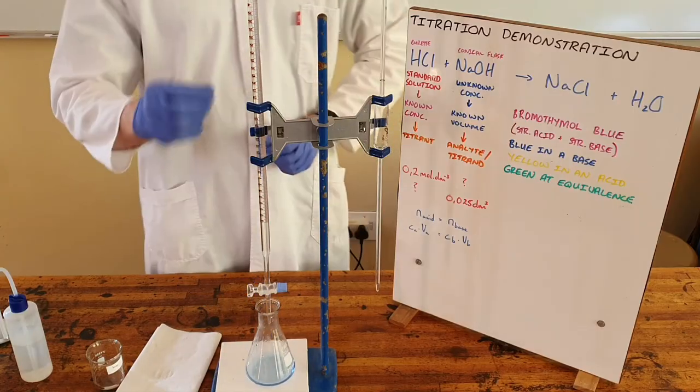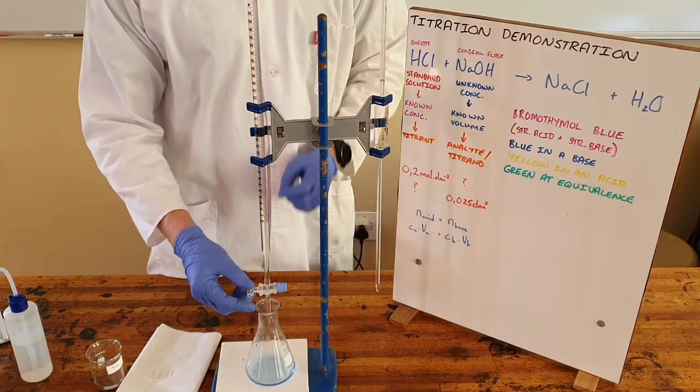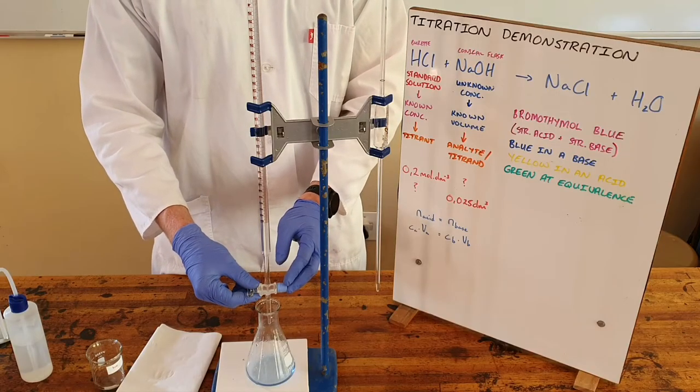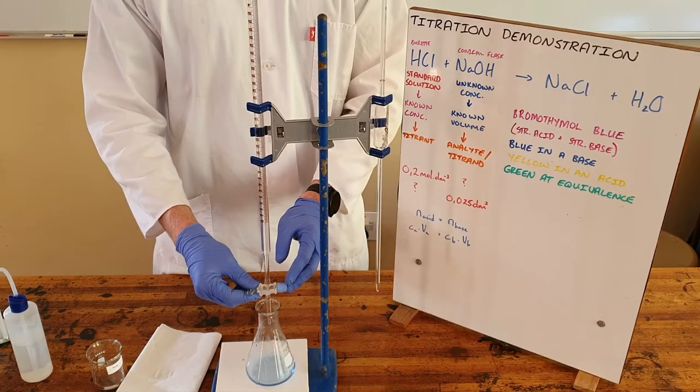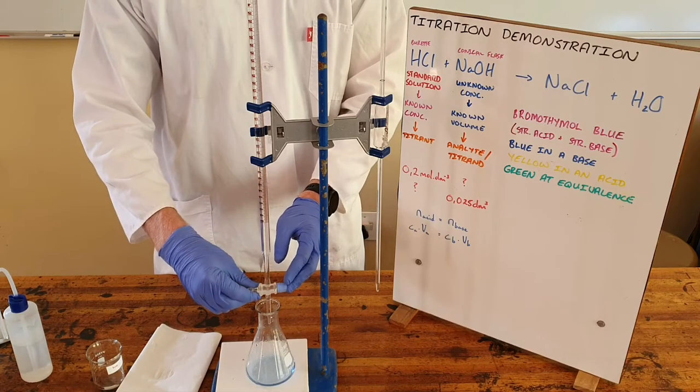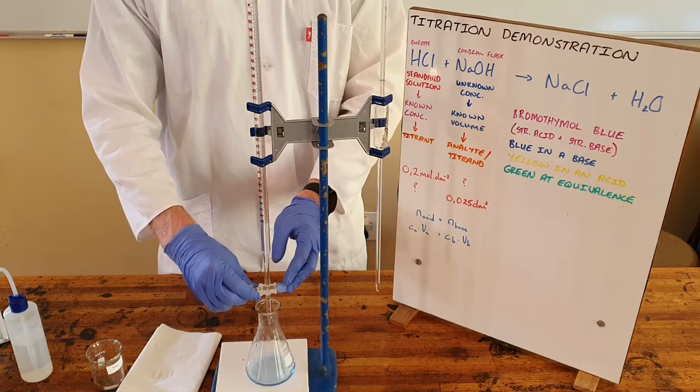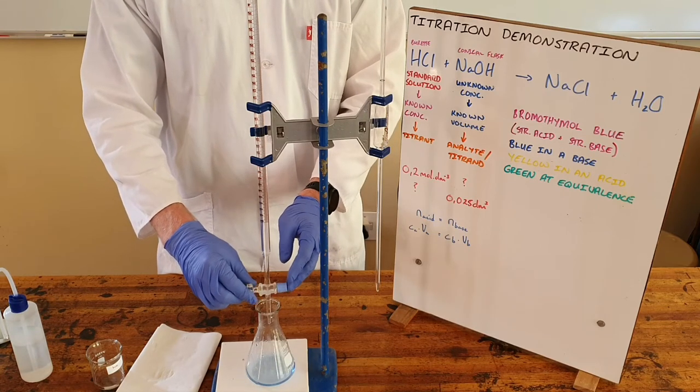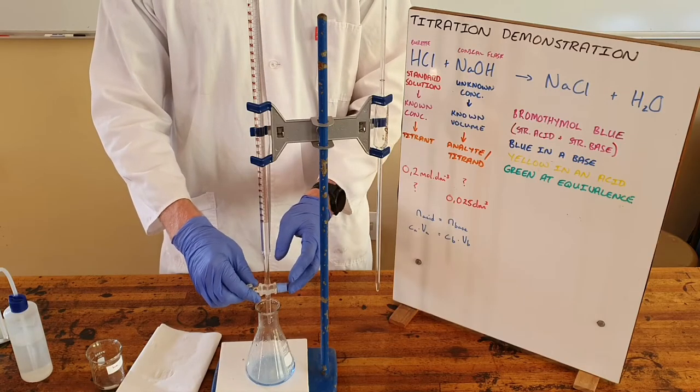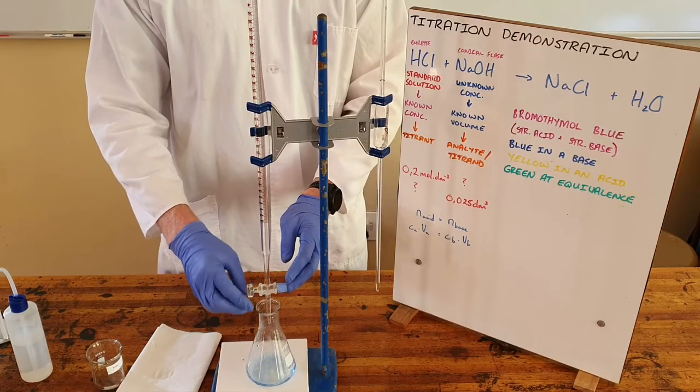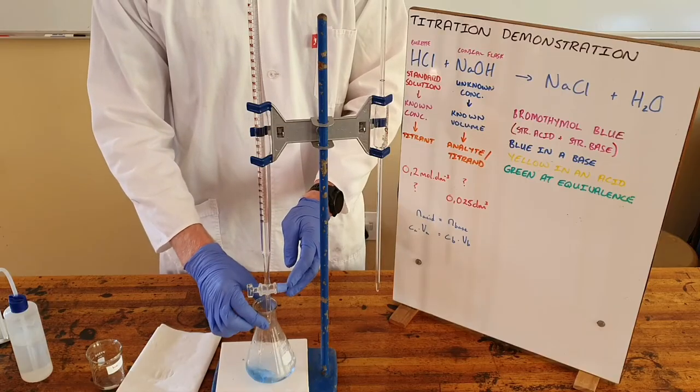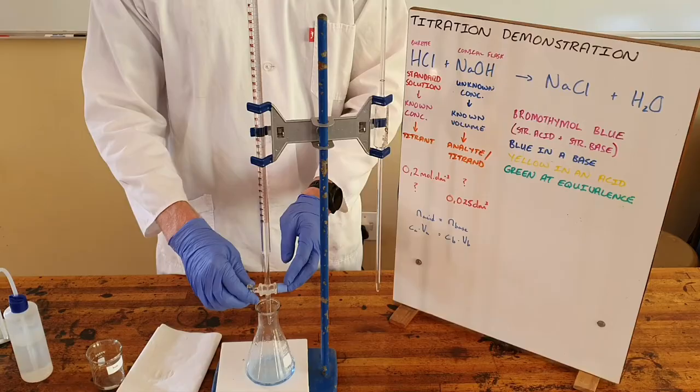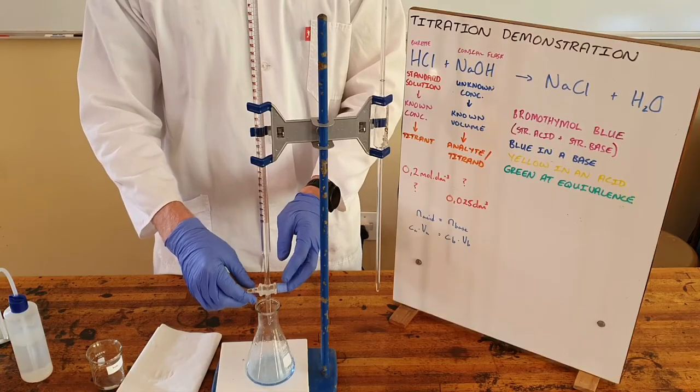So the titration is done with our burette here where we use a stopcock valve or tap to deposit an exact quantity of the acid or the titrant present. Now we have done a rough titration already. A rough titration is one where you allow this to run a bit faster so that you get an idea of where you expect the equivalence point to be. In this case we found in our rough titration equivalence point to be around 12.5 milliliters.